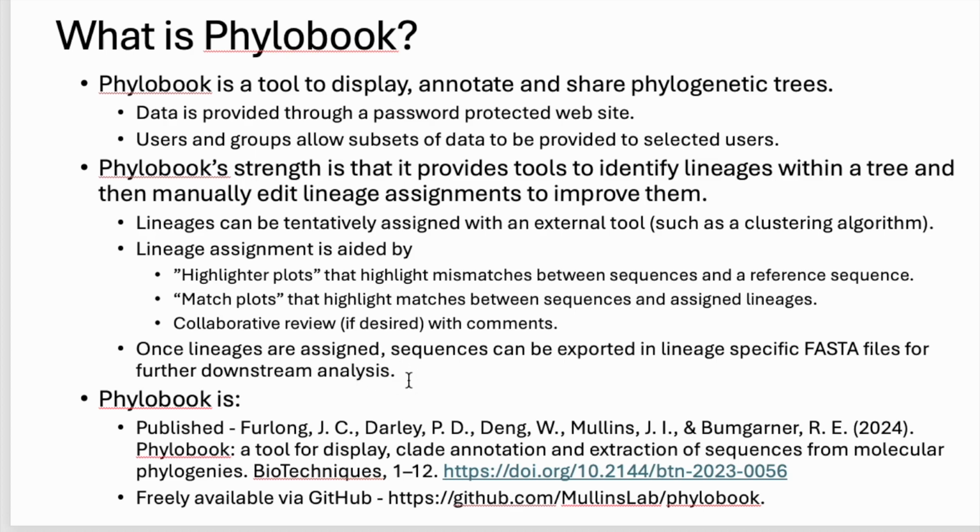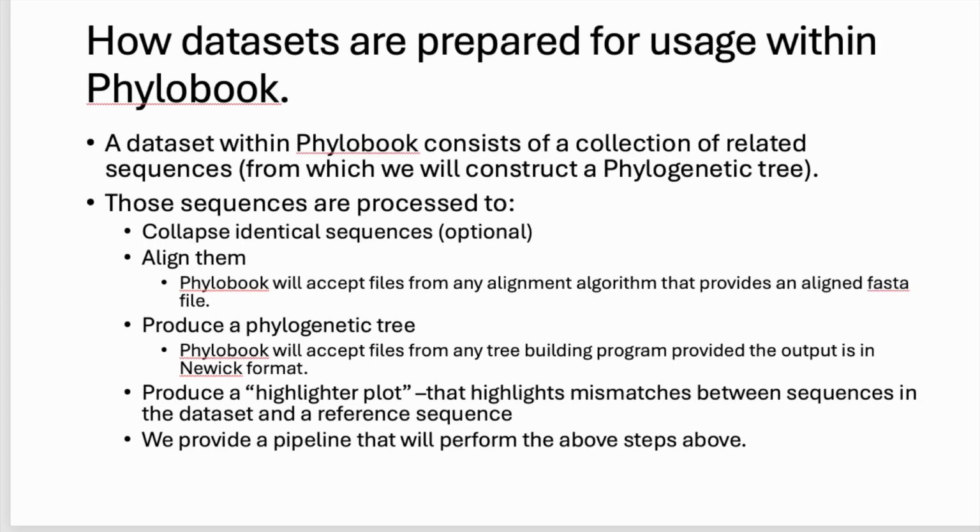PhyloBook is a published piece of software, so we wrote a paper on it, and it's available in Biotechniques with this link here. And then, of course, the software itself is freely available via GitHub.